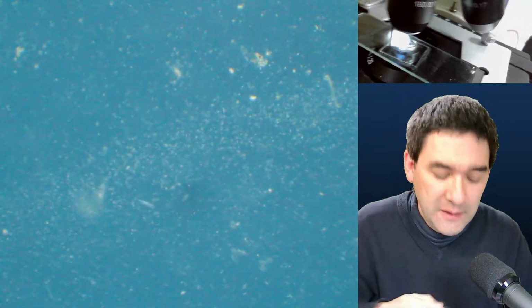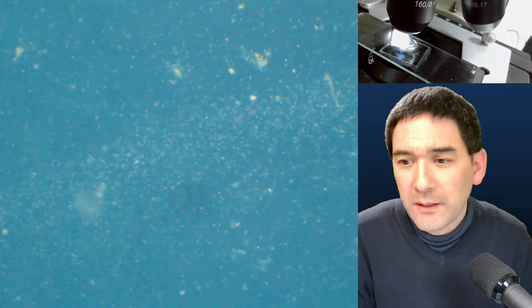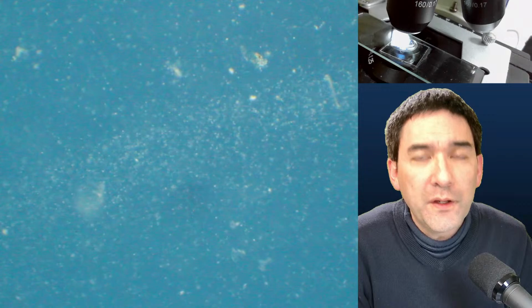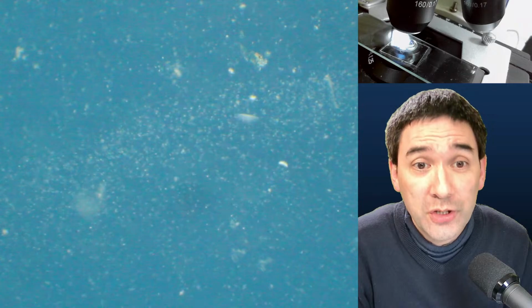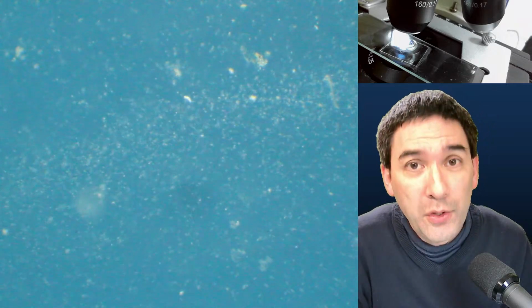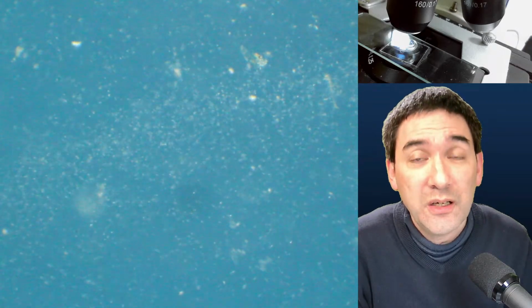Last comment. I think that's also something that I would like to mention here, and then I'm going to call it quits. Dark field is so sensitive to dust and dirt that apparently it is even possible to see viruses using dark field.